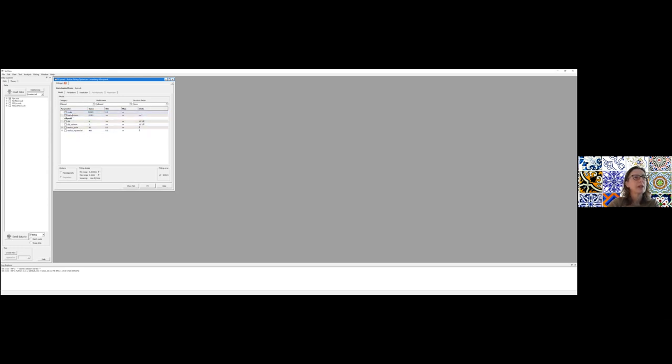Now, when you tick one of these options, it will fit that parameter. If it's not ticked, then it will not fit the parameter. So for example, if you know the volume fraction and you're sure of it, so you know that it's 1 mg/mL, you've measured it, you've confirmed it, and you do not want to fit this parameter ever, then you can right-click and constrain it to its current value so that you don't leave it ticked by mistake. So that's just a little trick that you can use. Now your background, I told you that the data has background subtracted. So to first approximation, let's set it to 0 now.